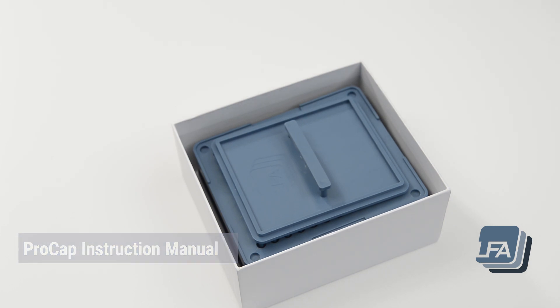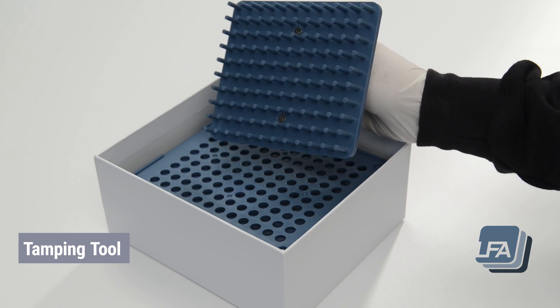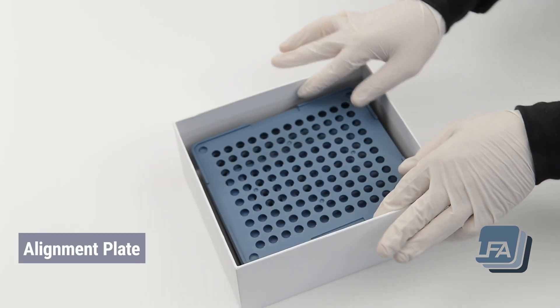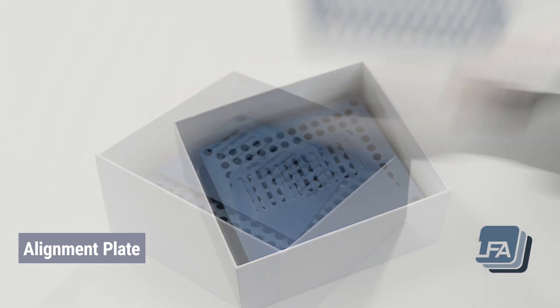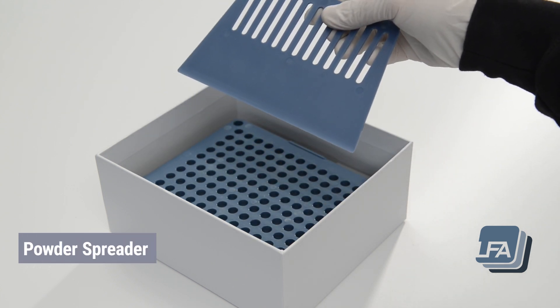When opening your new ProCap you should find the tamping tool, used to compact the powder gently. The alignment plate, used to load both the capsule bodies and the caps. The powder spreader, used to spread the powder across the capsule bodies.